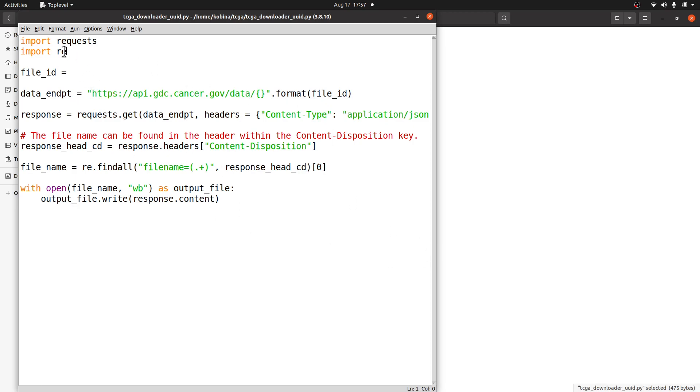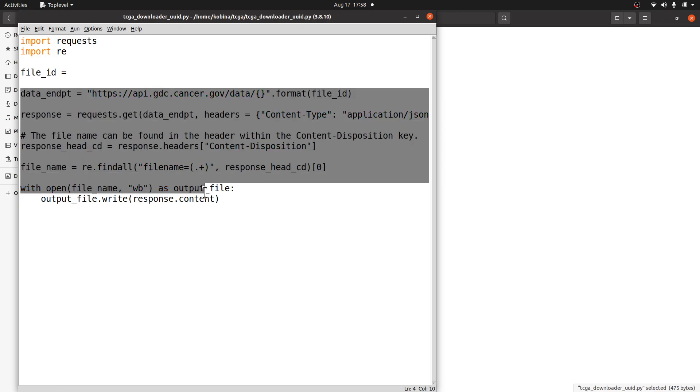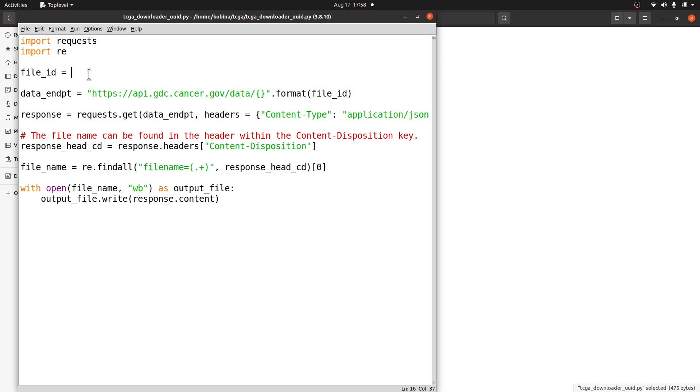You import these two libraries which come packaged with Python, and then you need to specify the file. This is the file ID we will get. Don't worry about this one - we will get it from the database. Then we have all this information which, once we supply the file ID and run the script, will be used to process.